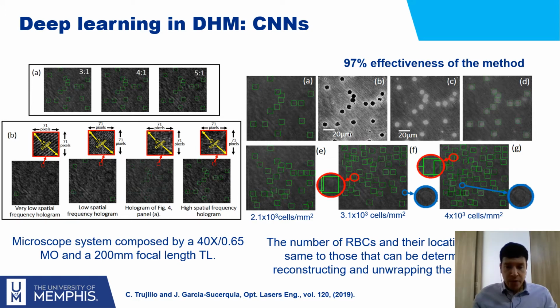Well, by comparing with the traditional way of doing this, that is recording the hologram, reconstructing the hologram numerically, representing this information in phase, and then unwrapping this information. As you all must be aware, this is a very complex procedure. Well, we obtain a final tomographic image of the sample, and in that way, we visually detected the accurate, the actual position of each one of the specimens.